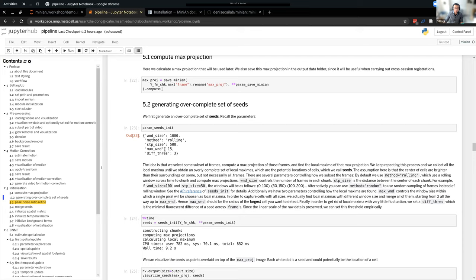Sometimes two cells are too close to each other — one cell fires and shadows the other, so they look like a single cell in a single max projection. To avoid that, we take multiple max projections across time and across different subsets of frames, to separate them as much as possible and get a different seed for each potential cell — making the set really over-complete. The parameters define the size of the rolling window and the size of the steps between windows. You want to make sure the step size is at most half the window size, so your whole time range is covered.